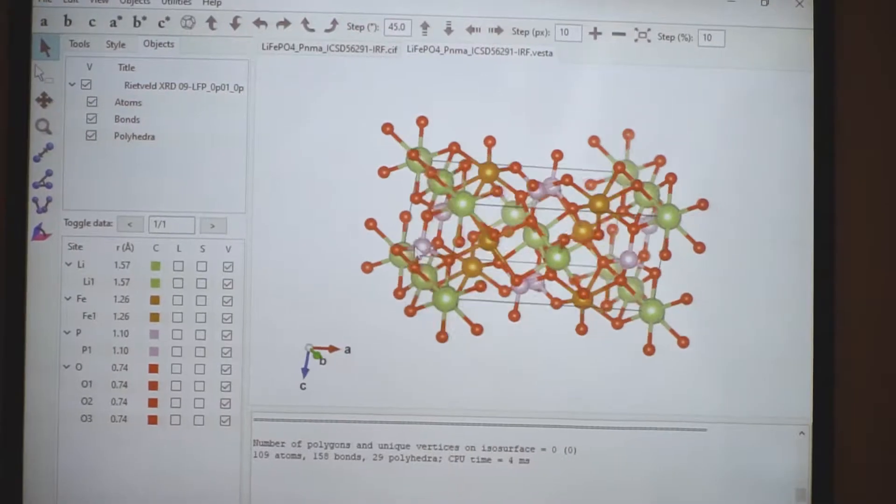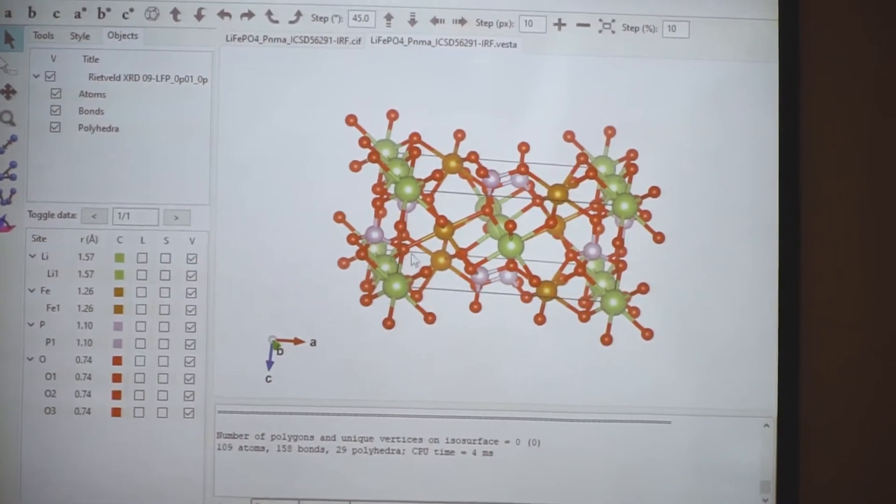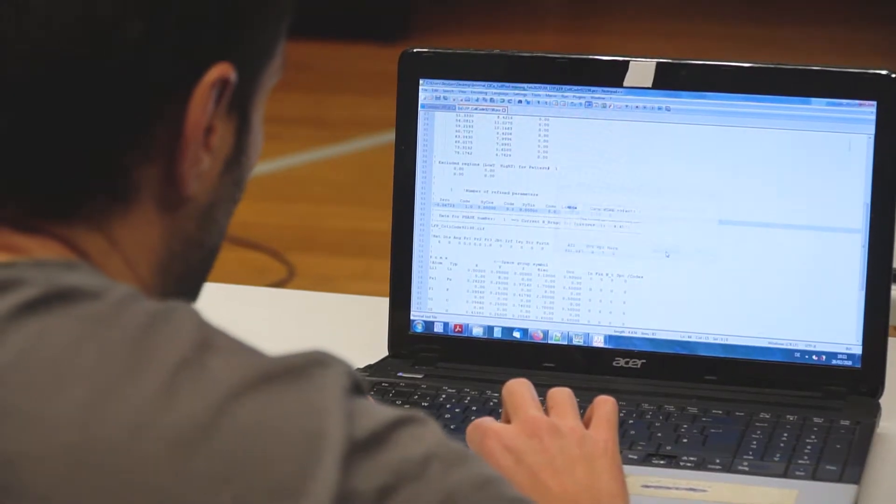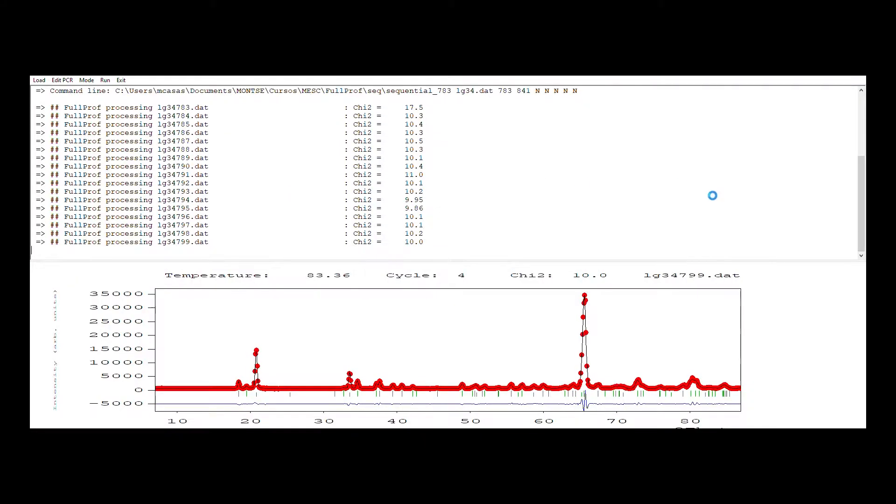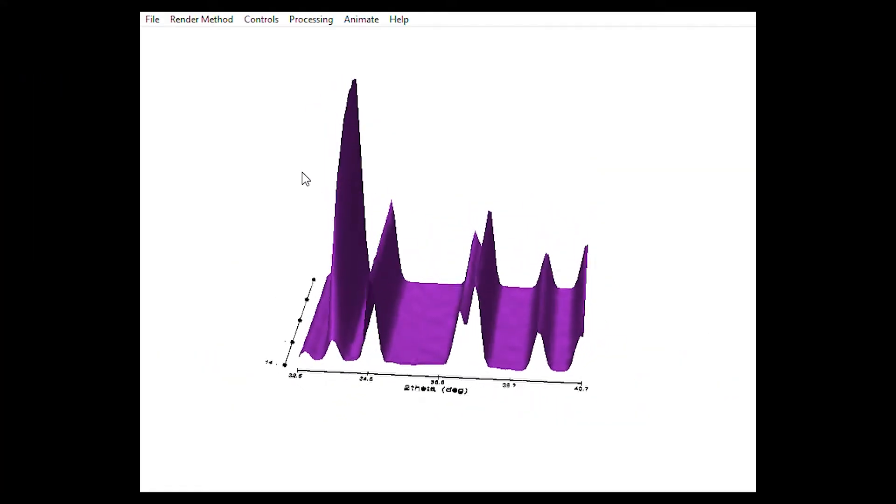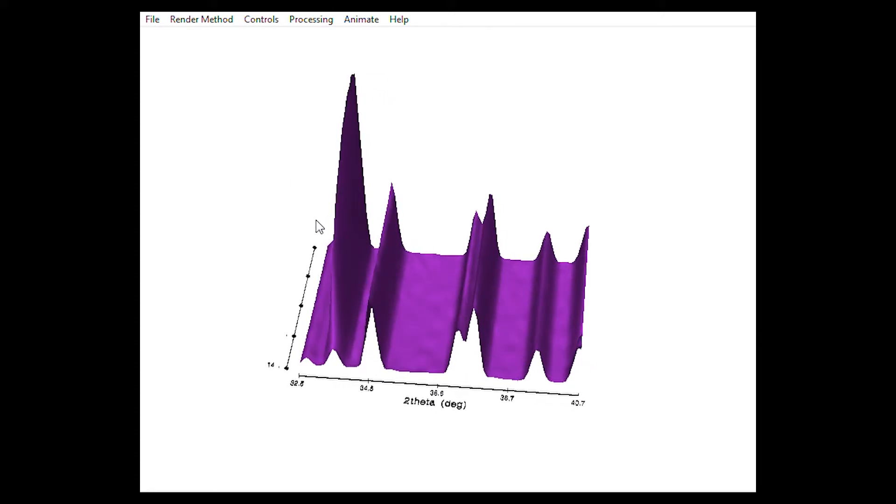Phase identification is done by comparing unknown measured data with known reference patterns taken from databases. Once identified, the pattern is analyzed by an iterative curve-fitting process using a structural model as a starting point, which allows to extract a sample's information.